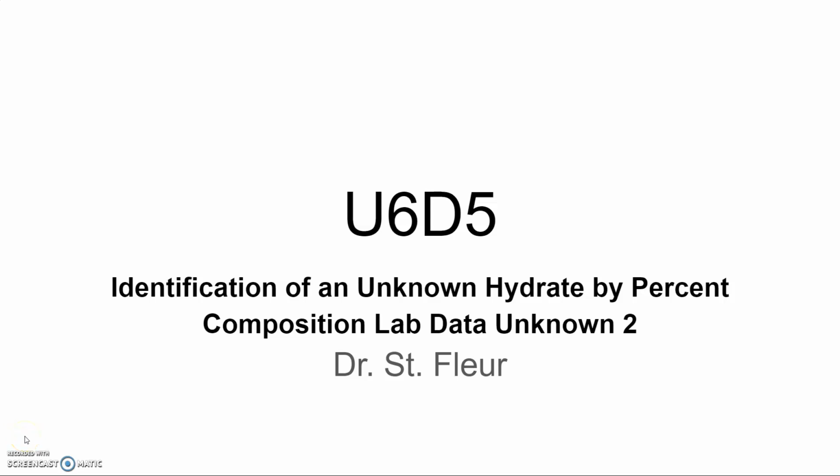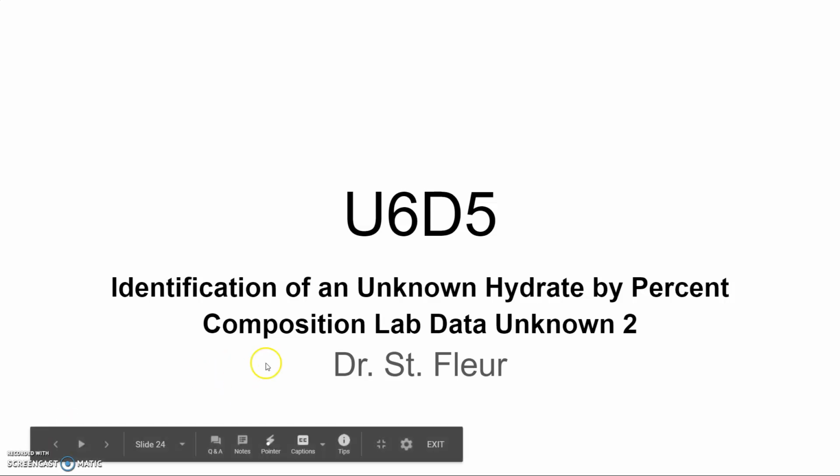This is the data video for unknown number 2. So if you've selected this video, you have chosen to do unknown number 2.